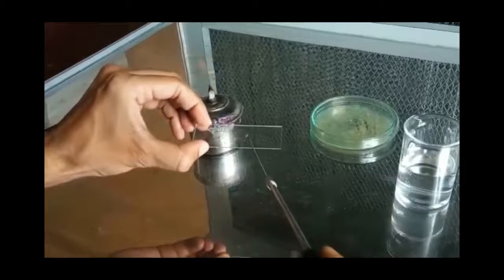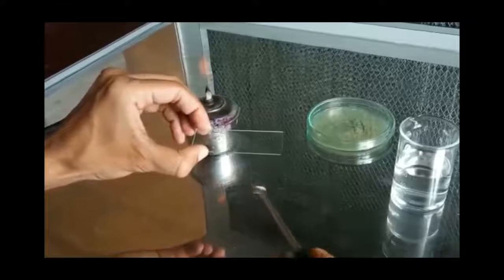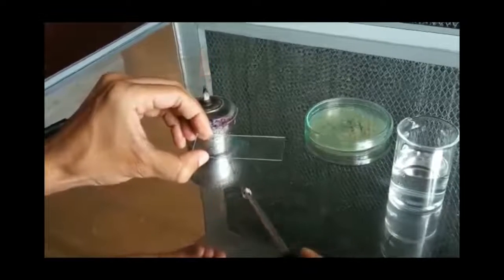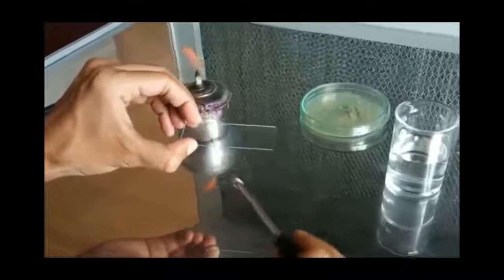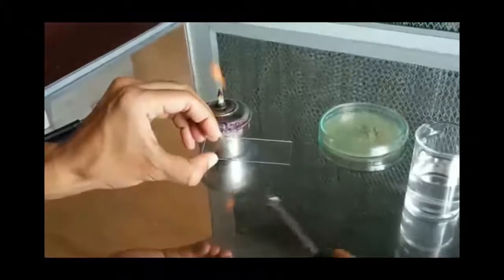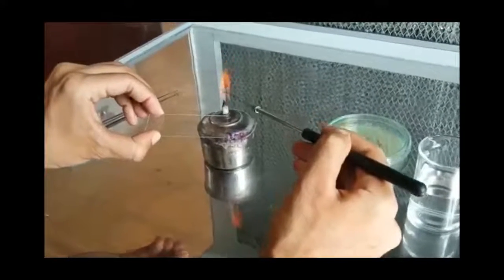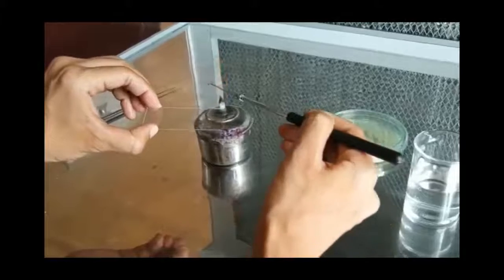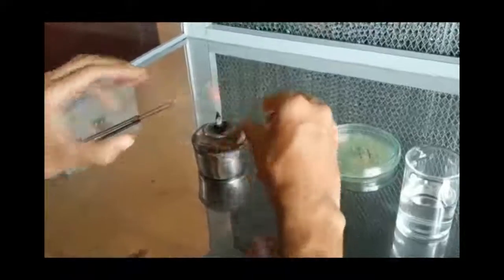We are preparing the smear on the sterile glass slide. The smear has to be proper so that the staining is properly done and we are able to visualize the organisms. The inoculation loop is again sterilized and then kept aside.